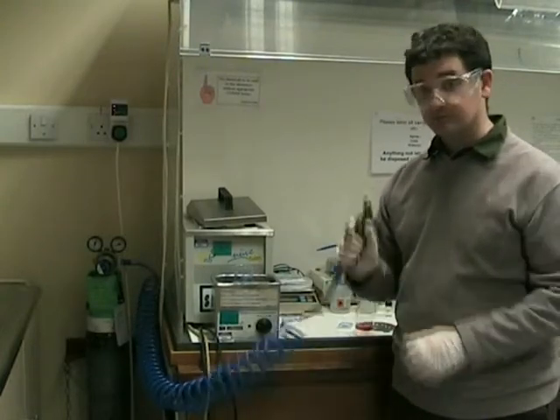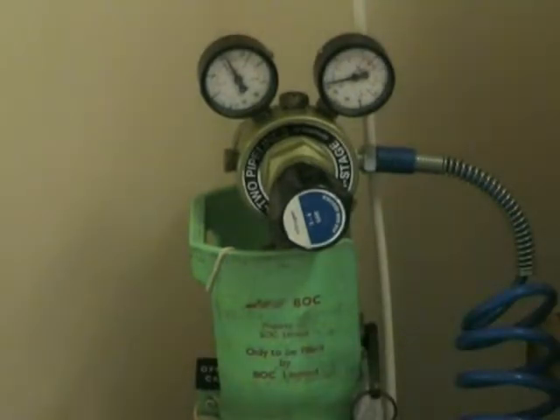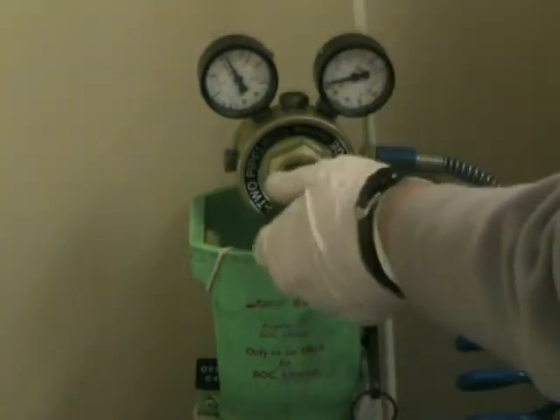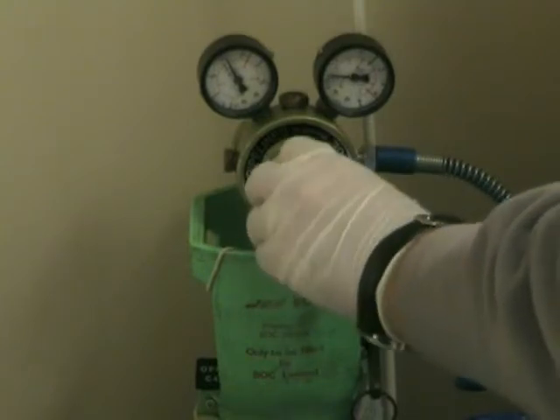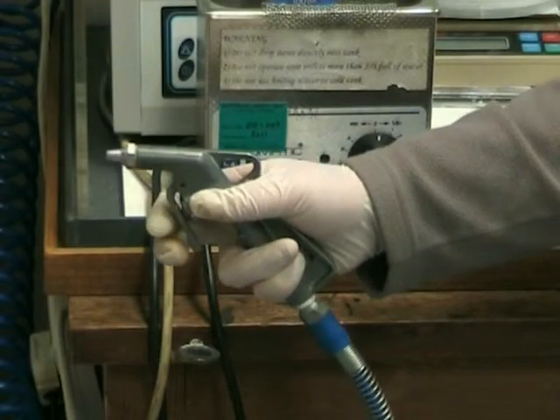After the sample has finished in the IPA, we will need to dry it. To do this, we use the nitrogen gun. To get the nitrogen flowing, first pull the levers down, then turn them until the pressure on the right side reads about half a bar. The nitrogen gun should now work.